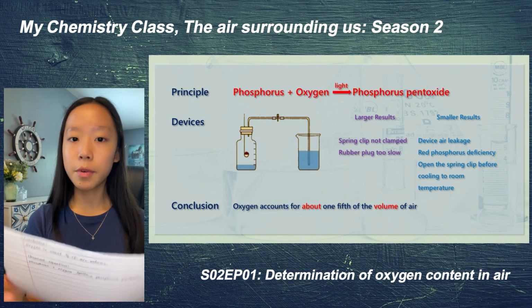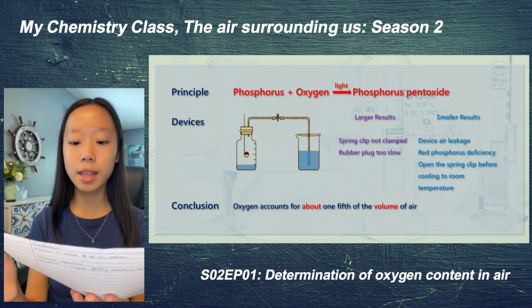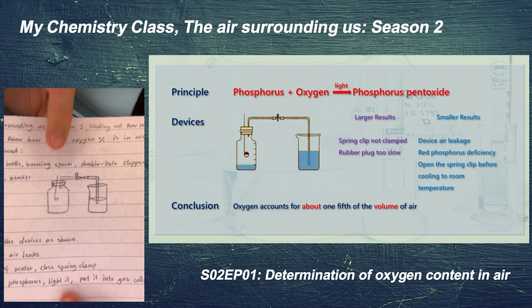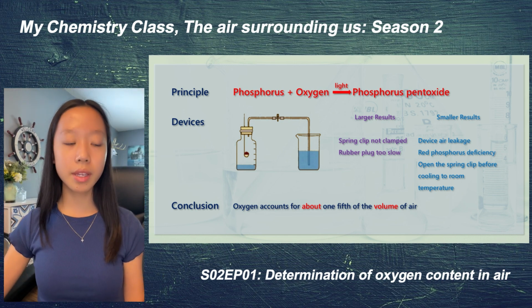And then step number 4 is to add red phosphorus, which is used for burning. And then we light it up and put it onto this little spoon and then put it into the gas collecting bottle. So after all those steps, what do we see?